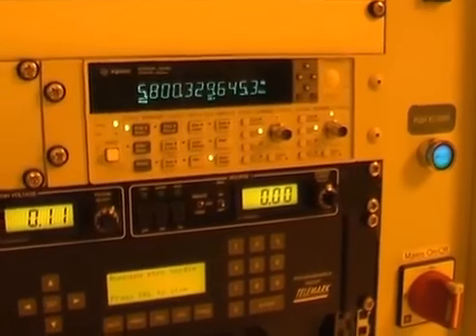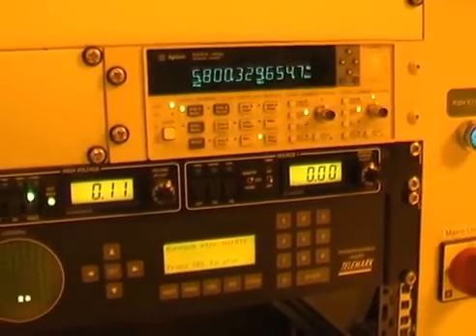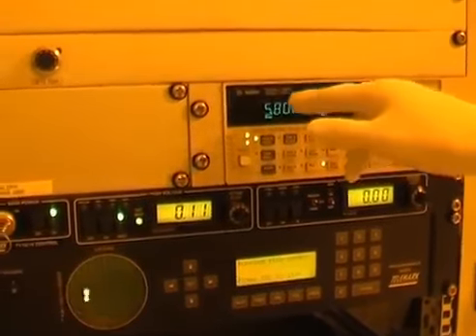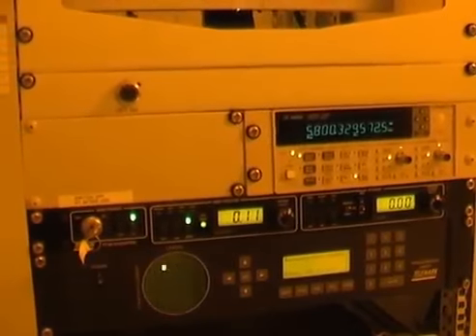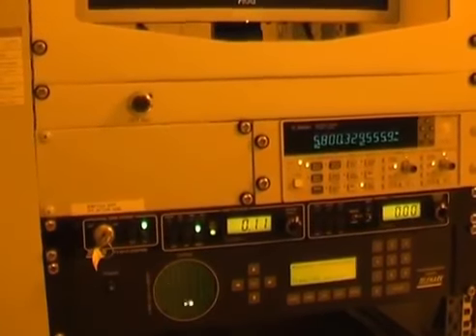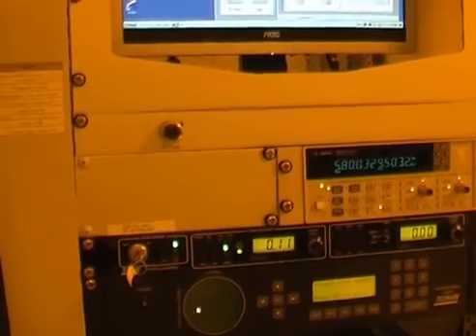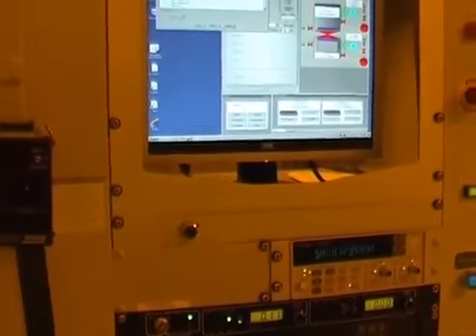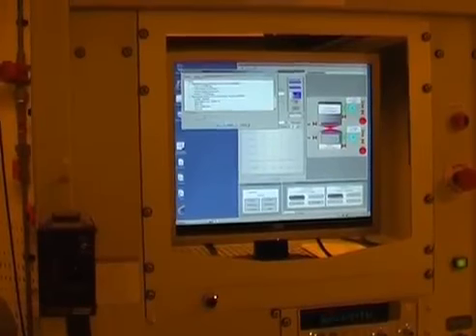And the crystal needs to be periodically changed because it has an initial frequency of 6 megahertz, if I'm not mistaken, and as we deposit metal, metal will start accumulating on the crystal surface, and the oscillating frequency of the crystal will decrease.